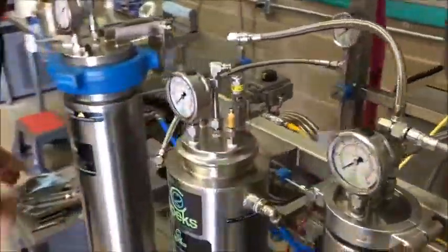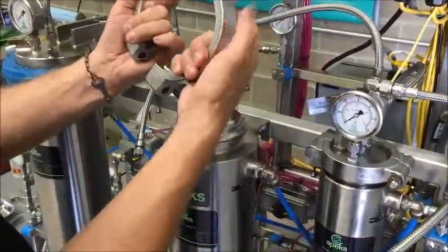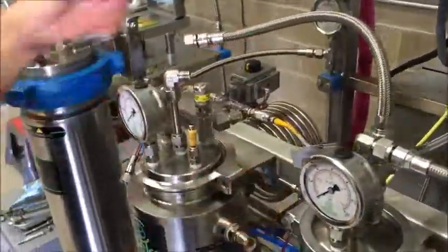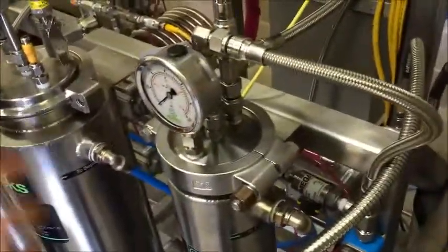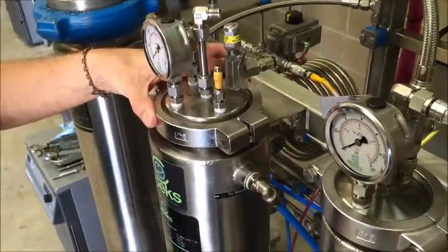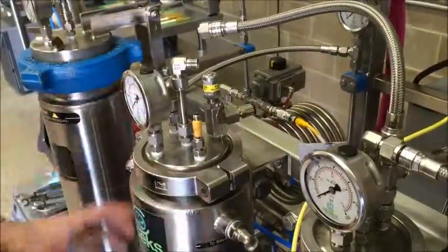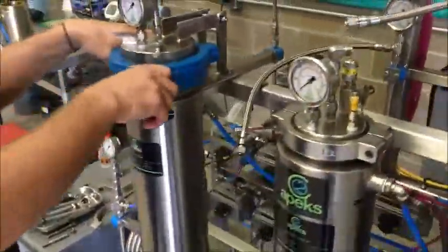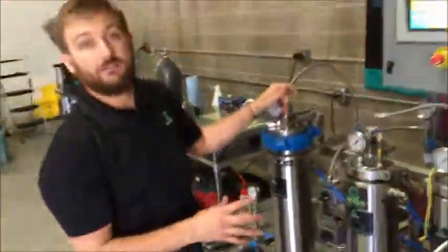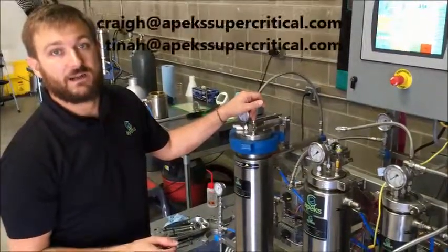Now it's time to reassemble everything. Put that back on, put these clamps on — the clamps have a notch in them, put the notches opposite each other. We're going to put all this back together, reattach our collection cup, reattach these lines, put our thermocouple back in, and then we're essentially done. Then we would reload our material, tighten this up, and hit start for the next run.